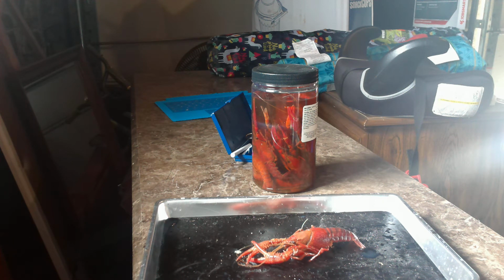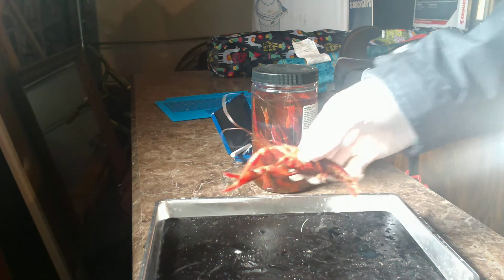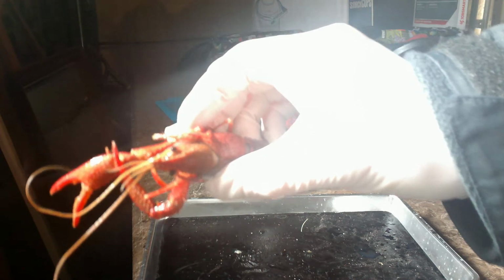All right, guys. So we're gonna go ahead and do our second arthropod dissection here with our crawdad. So here we go. We have our crawdad. So the first thing we need to determine is if we're working with a male or a female here.